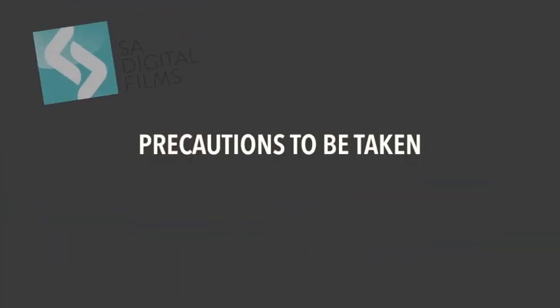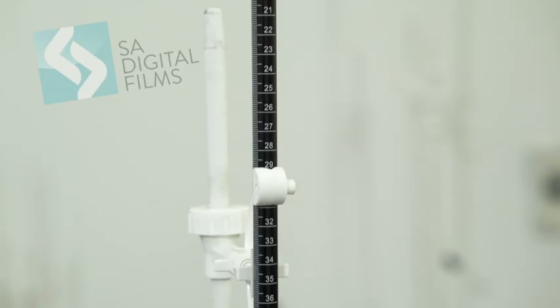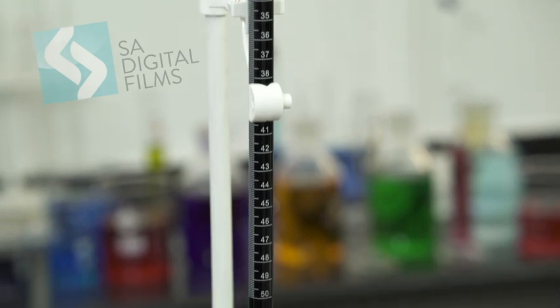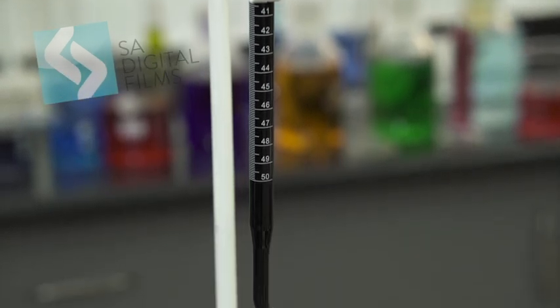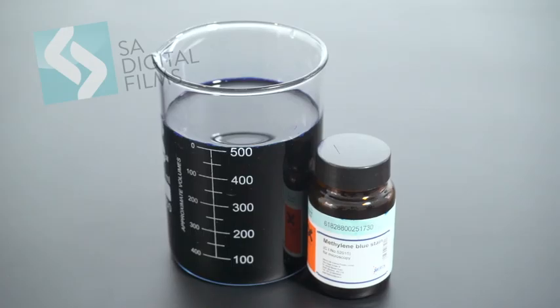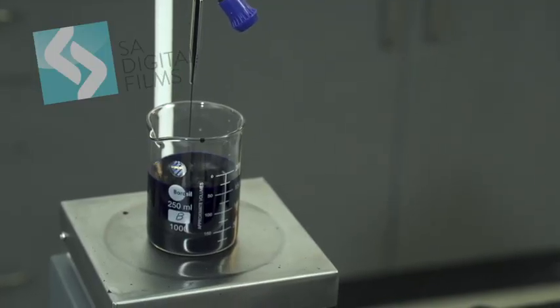Some of the precautions while doing this analysis are: use calibrated burette. In the later stages of the titration, use incremental addition of 1 ml followed by 2 minutes stirring to ensure the completion of the titration. Avoid direct handling of methylene blue powder as it is a strong dye. Take care while stirring the sample bentonite solution to avoid spilling.